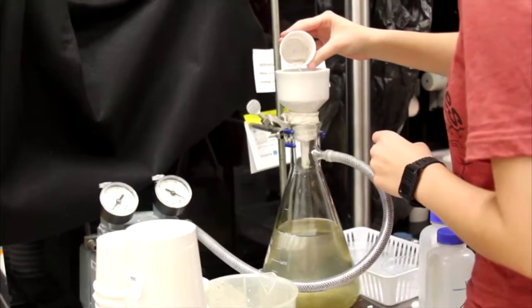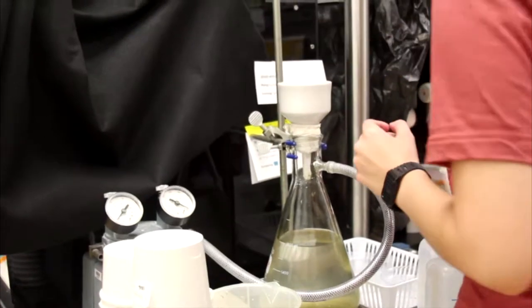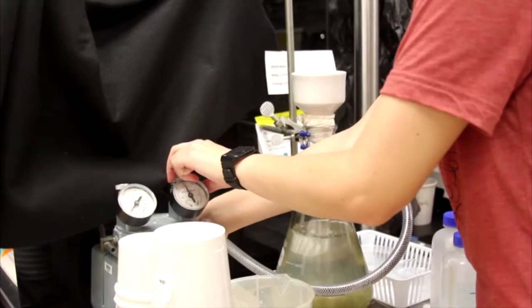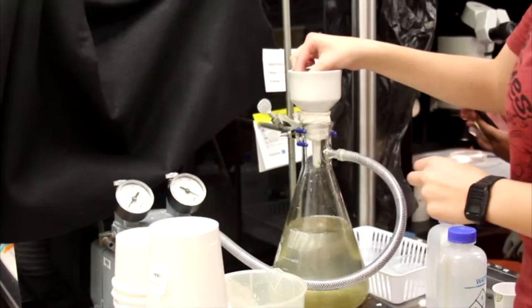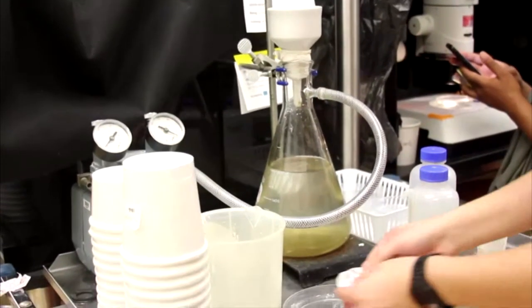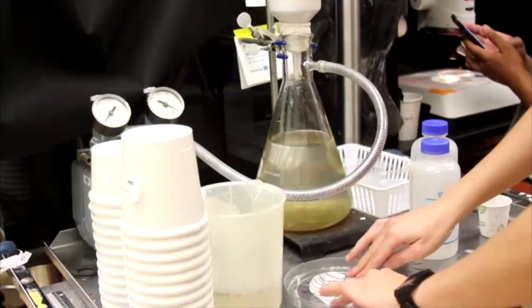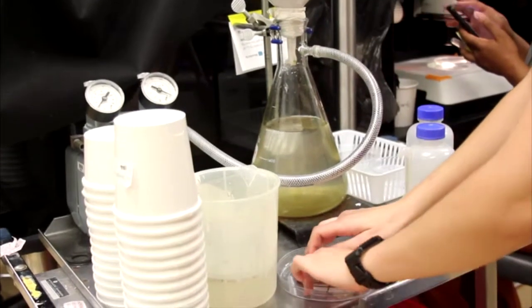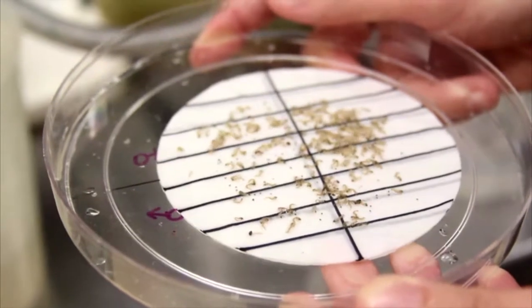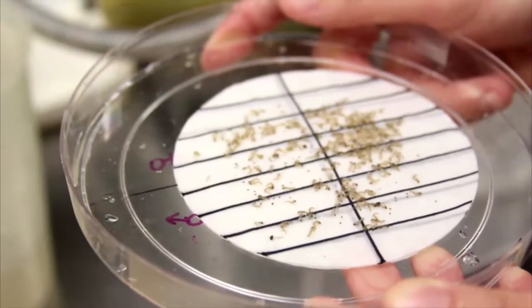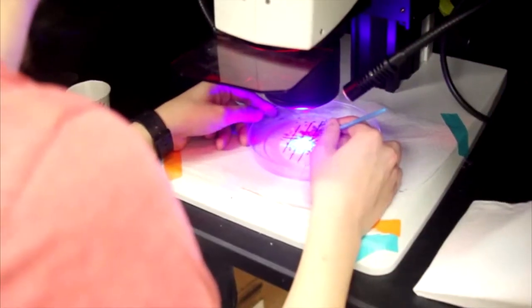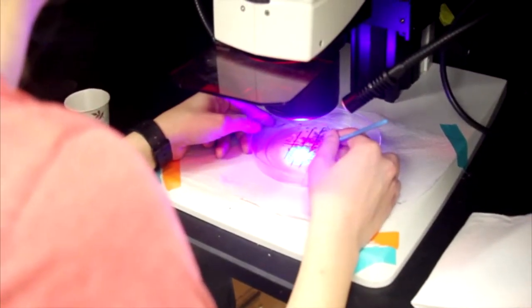Pour the larva onto the filter paper and use a vacuum pump to remove the excess water. Be careful not to vacuum it for too long as this may harm the larva. Add a couple drops of water to the petri dish to prevent the larva from drying out.